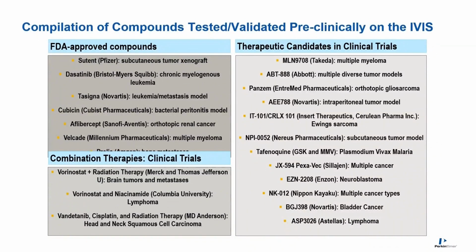So shown here is a slide from some time back that shows the compilation of compounds or drug candidates that have been tested or validated preclinically on the IVIS imaging platforms in different cancer disease models.